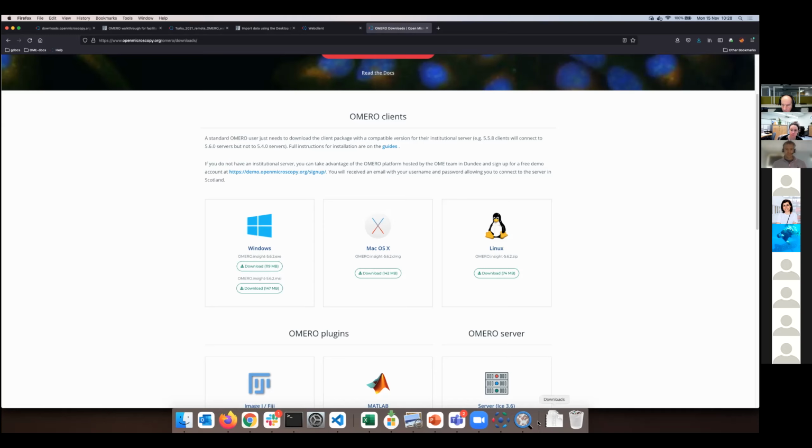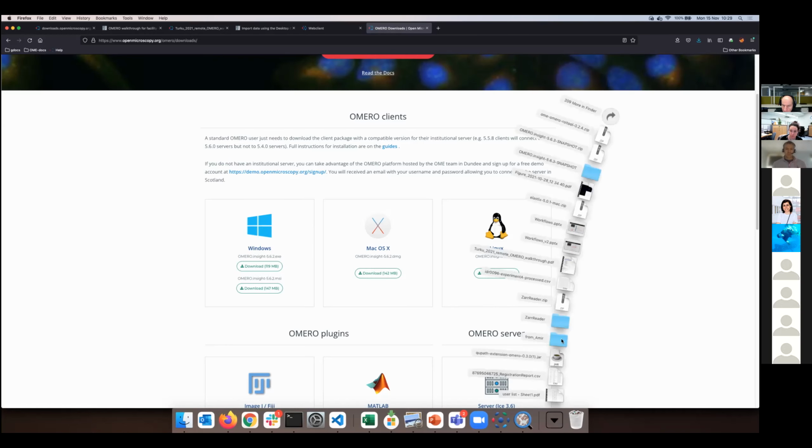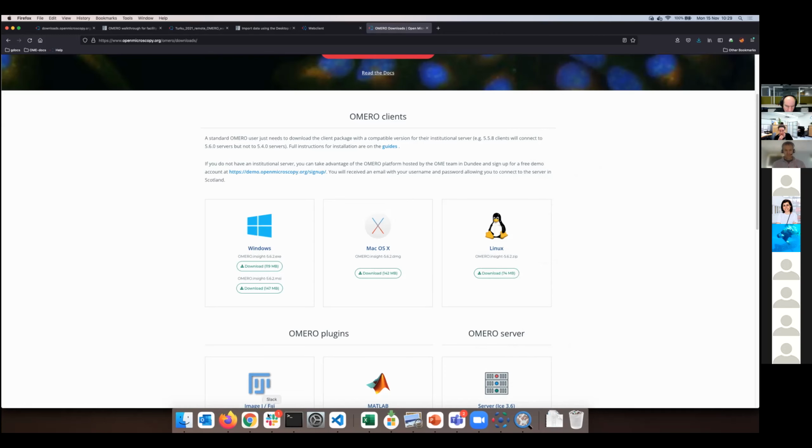You downloaded tons of stuff from the internet, I'm sure already. I will not bore you with that. After the download is done, it will pop up a new icon here in the downloads folder, or you will find it. You simply click on it and the installation is natural. Okay, so if you didn't do that, I will not go through that because the download will take time. I will just start my Insight, and then we can touch base on that. Where are you, ladies and gentlemen, with respect to this workflow?